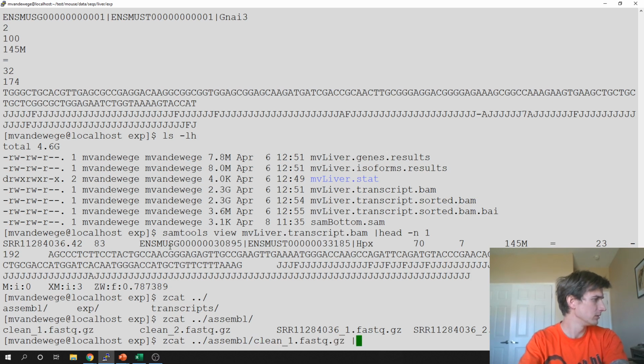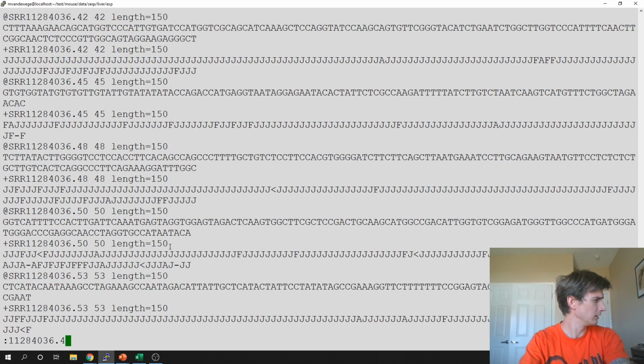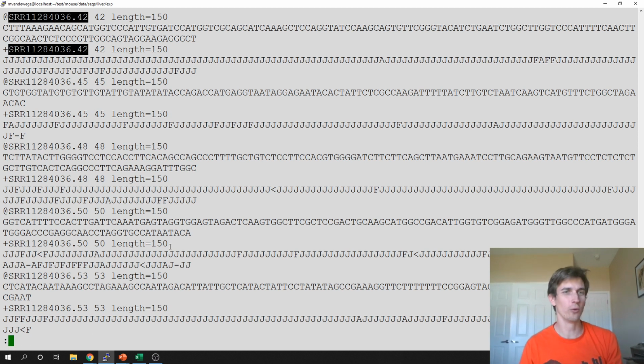Clean one, head, whoop, I didn't want to do that. Let's see. Yeah. So that first read that popped up in the BAM file is the first read that we would find in the FASTQ file.